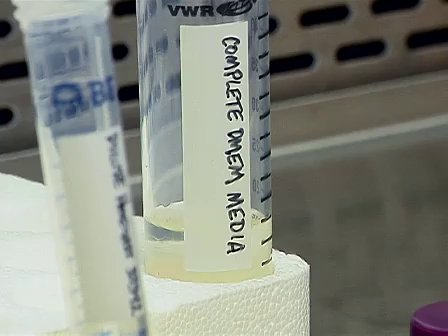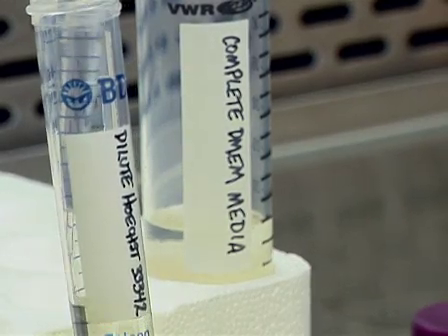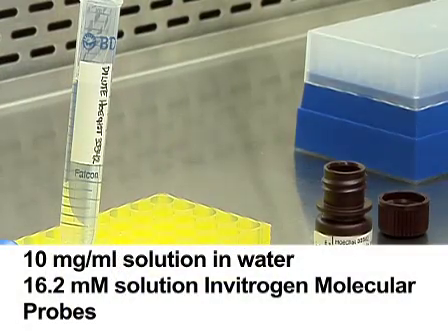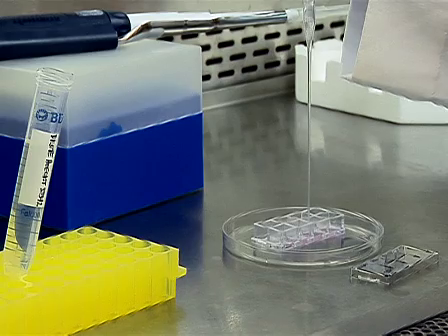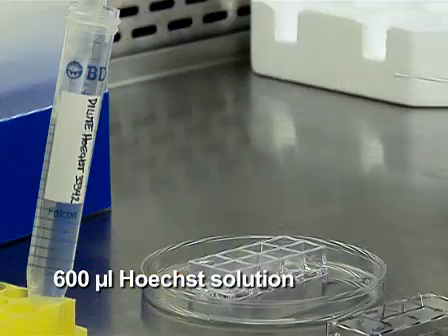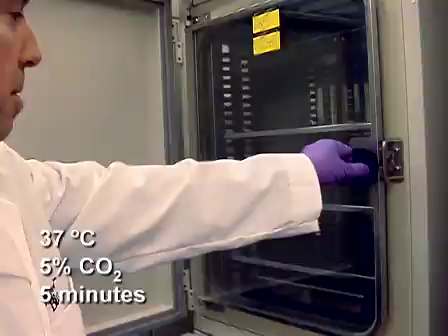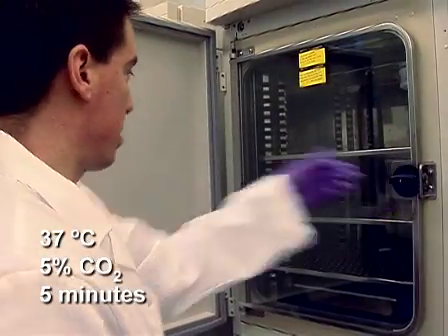While the samples are incubating, prepare Hoechst solution for nuclear staining of samples. Mix 1 microliter of Hoechst 33342 trihydrochloride trihydrate in 10 milliliters of complete DMEM. When the incubation is complete, remove the dilabeling media from all samples and add 600 microliters of the dilute Hoechst solution to each sample. Incubate samples at 37 degrees Celsius, 5% carbon dioxide, for 5 minutes.